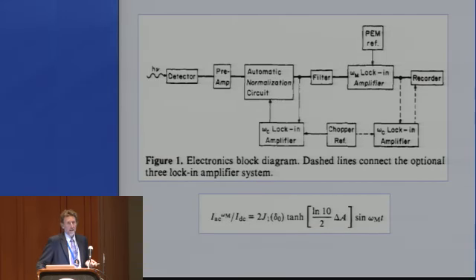And I'm showing the instrument diagram for a couple of reasons. It has lots and lots of lock-in amplifiers, and there's an auto circuit. To do the IR with a dispersive instrument, you need a light chopper. And the light chopper is important to define zero intensity because room environment provides infrared intensity that the detector sees. But this last little loop here was a way of cleaning up the VCD signal coming out of the high-frequency lock-in. And that's because interfering with the output of this is just stray radiation from the room. But if you also pass it through a second lock-in tuned to the chopper frequency, you can clean up and get rid of that RF interference.